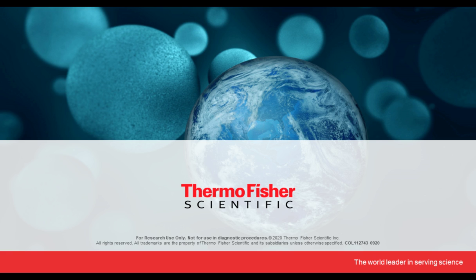Yeah, so that's a very good question. With the way this protein label works, obviously they are binding to lysine amino acid specifically. So now if your target protein has lysine in the antibody detection pocket, then there is a chance that there is going to be some interference in detecting that particular target protein.